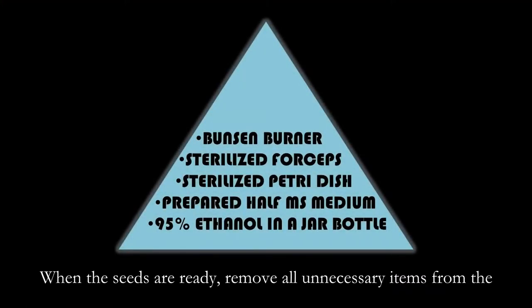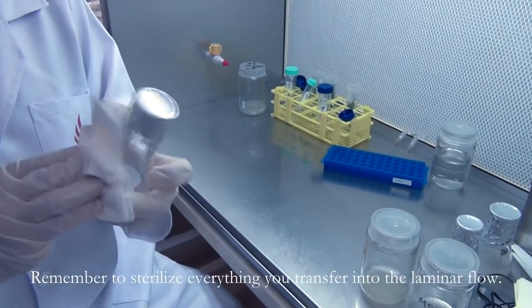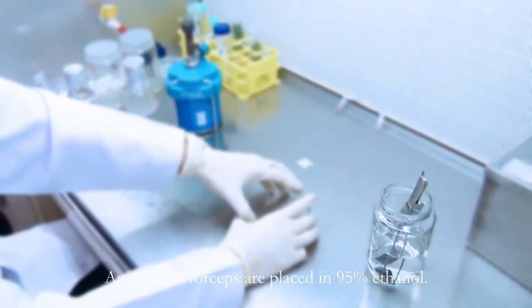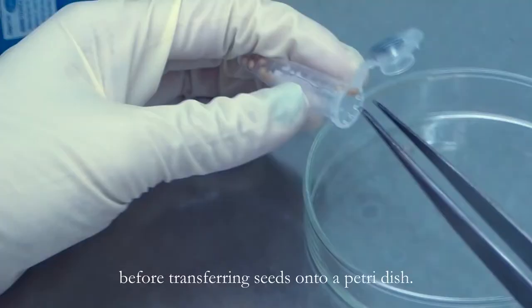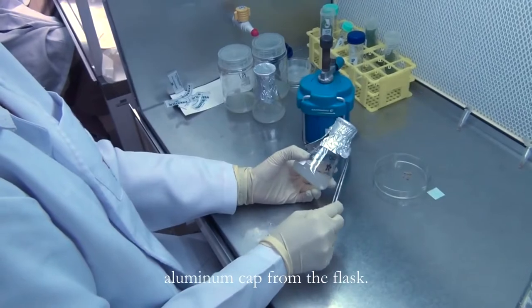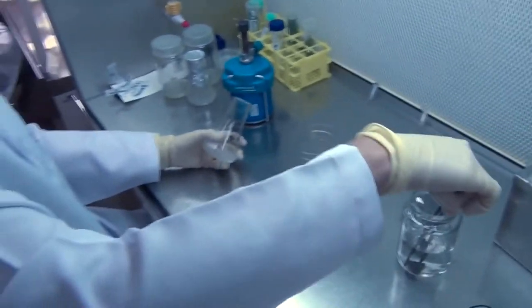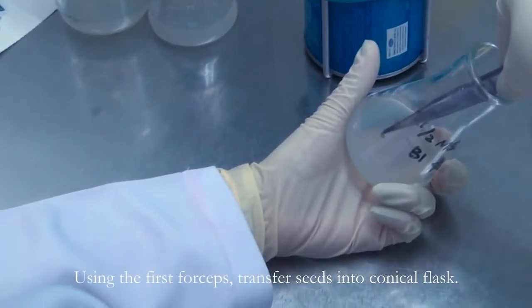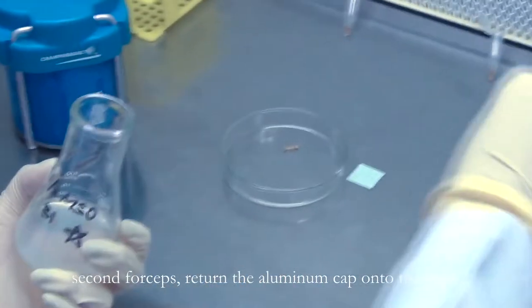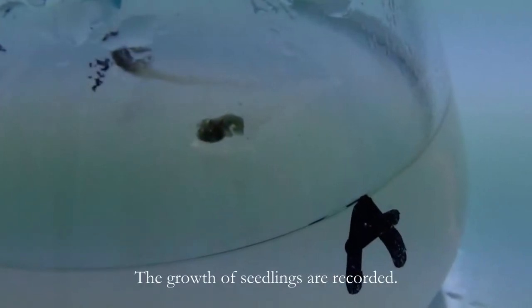When the seeds are ready, remove all unnecessary items from the laminar flow and make sure the following items are in the flow. Before you start, remember to sterilize everything you transfer into the laminar flow. Autoclave forceps are placed in 95% ethanol. A forceps is flamed and left to cool down before transferring seeds onto a petri dish. Another forceps is flamed and used to remove the aluminum cap from the flask. Place the aluminum foil in an inverted position. Place the forceps back into the ethanol after flaming. Using the first forceps, transfer seeds into the conical flask. The mouth of the conical flask is flamed and, using the second forceps, return the aluminum cap onto the flask. Observations are made weekly for 3 months before the next procedure. The growth of seedlings are recorded.